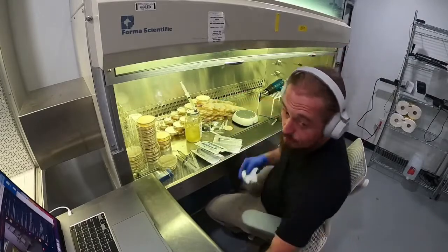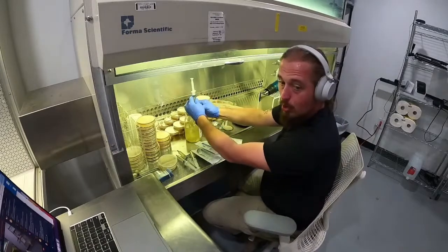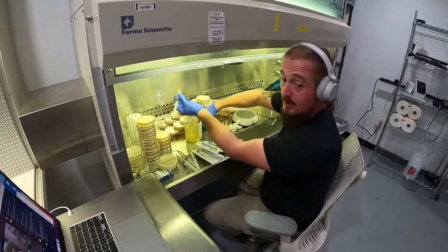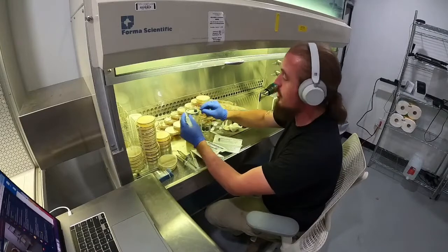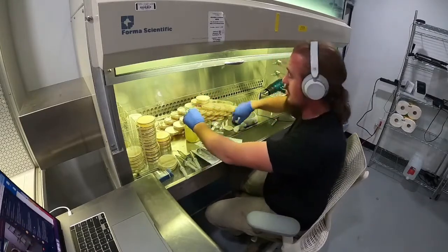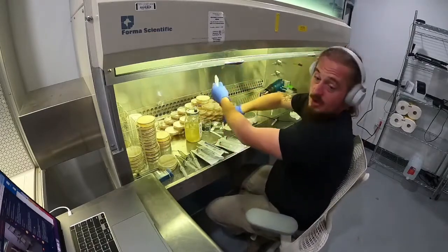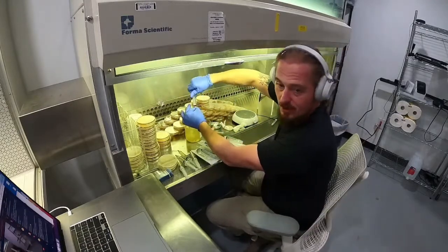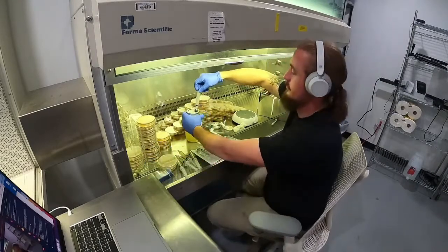Because something as simple as the size of the hole or the adhesive you use on your filter patches and injection ports, that's all the difference, right? Because if this adhesive fails on this injection port, contamination. If the adhesive fails on those patches, contamination. If you buy a knockoff mushroom bag on Amazon, and it's got a filter micron size of 0.7 or larger, contamination, right?